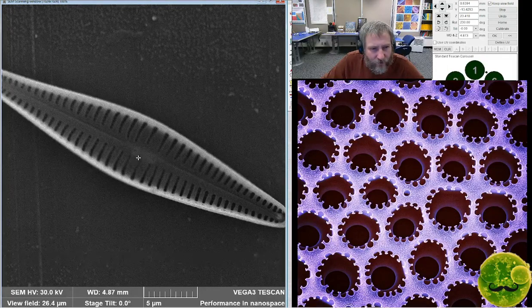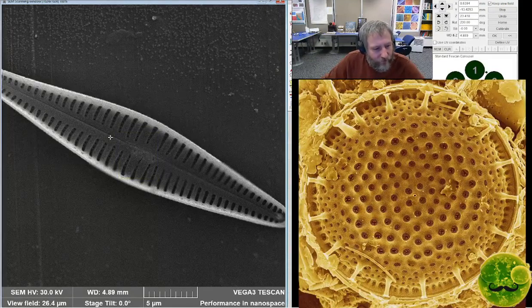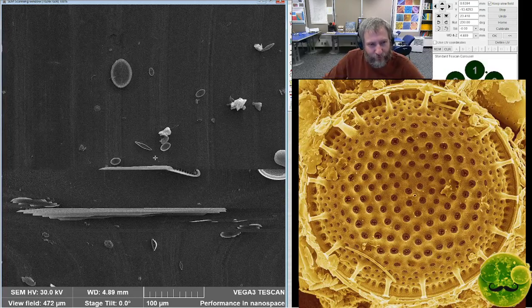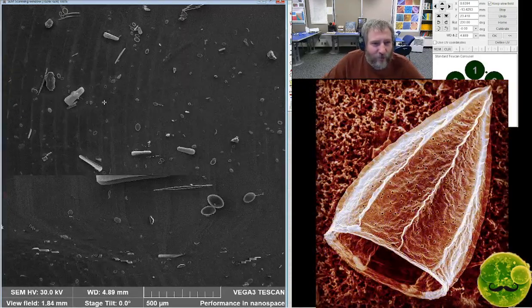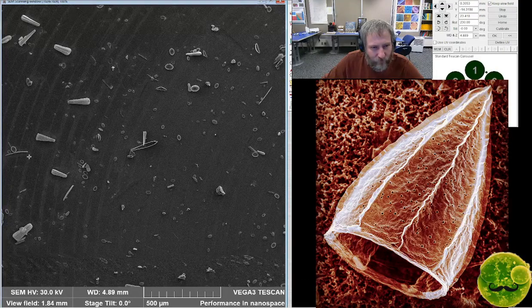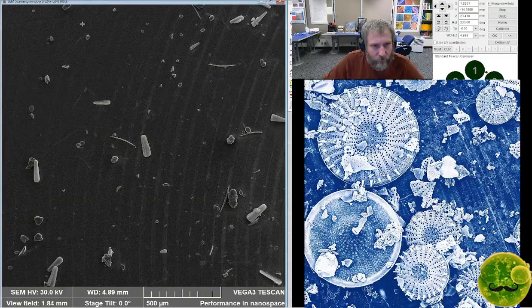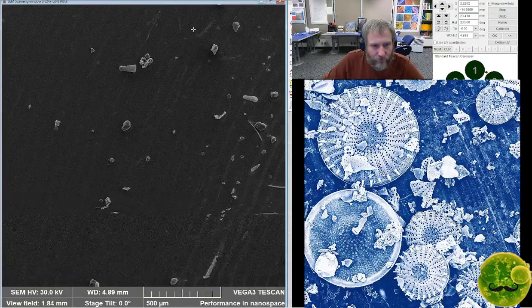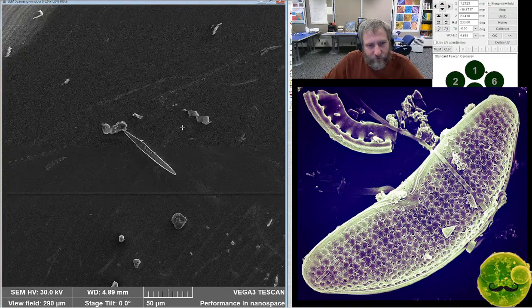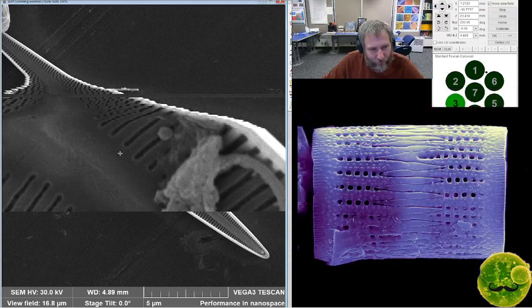Stigma. So I'm particularly interested in a group of diatoms, in a genus of diatoms called Afrocymbella, and also Gomphonema, and things that are closely related to it. I never thought of myself as specializing in something like that, but I kind of do. So, mostly focused on those for these samples. I wasn't trying to become a specialist in a group, but this group is so poorly understood that I keep getting sort of dragged back into it.